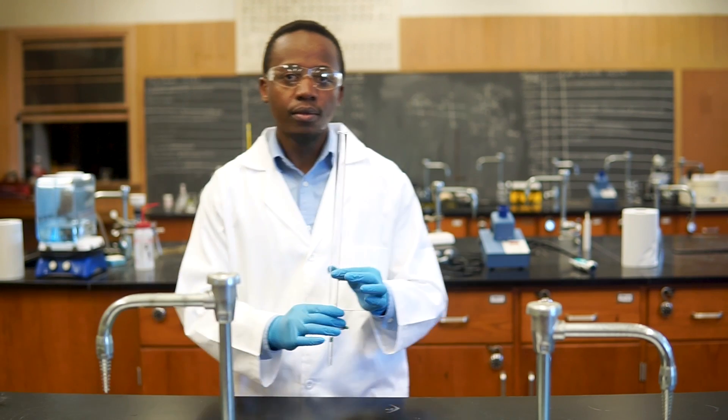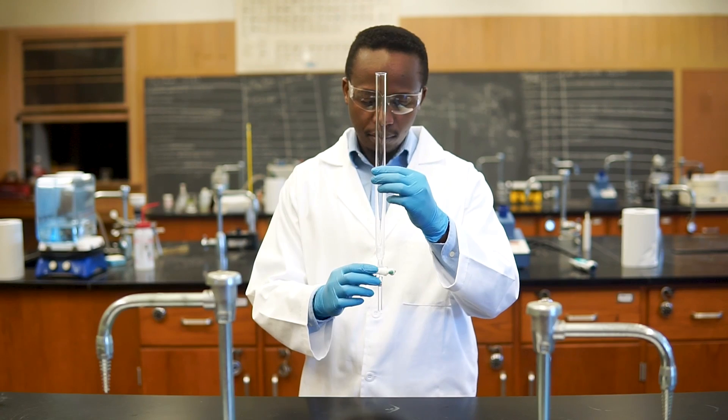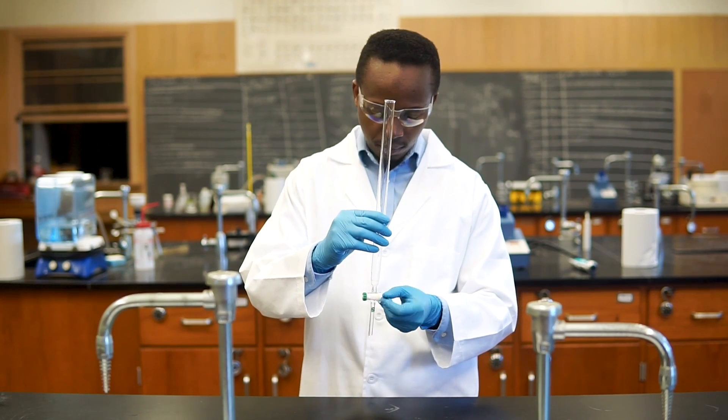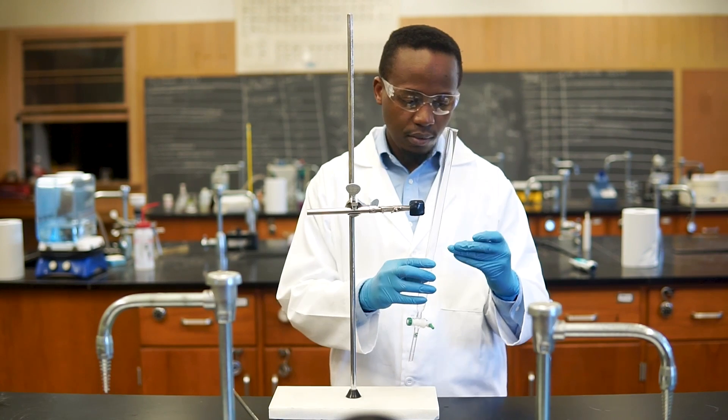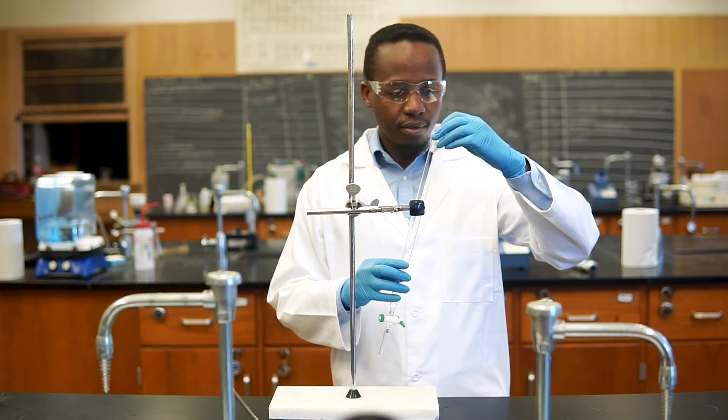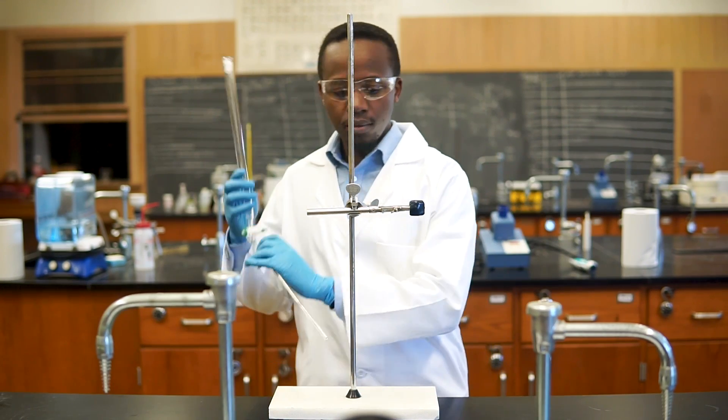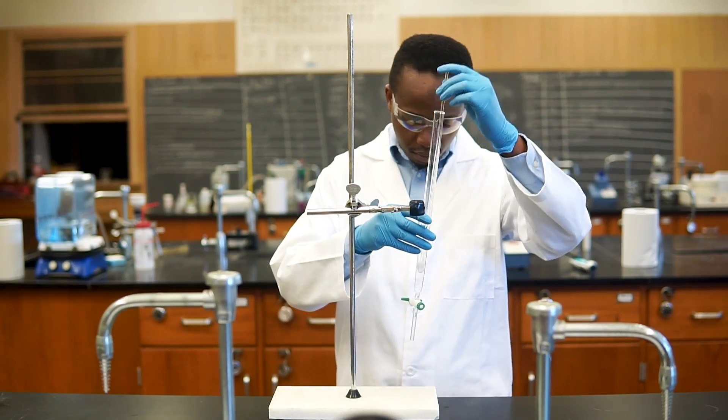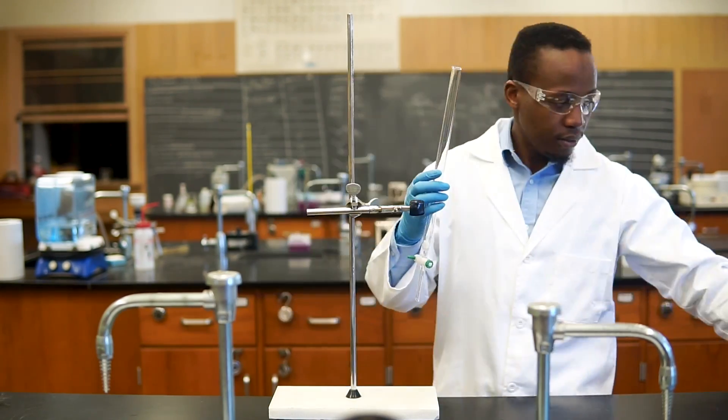Now it's time to perform the technique. We'll start by packing our glass column. As you can see, the column has a stopcock at the bottom, so make sure it's closed. We'll then add a cotton ball to the bottom. This is so that our gel doesn't go through, as it is a fine powder and can easily slip through when we open the stopcock. Using a glass rod like this one, we'll push the cotton down like this.